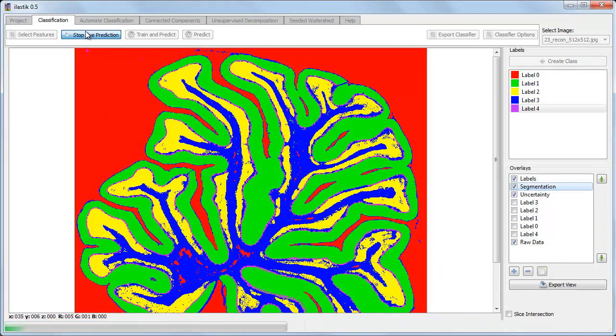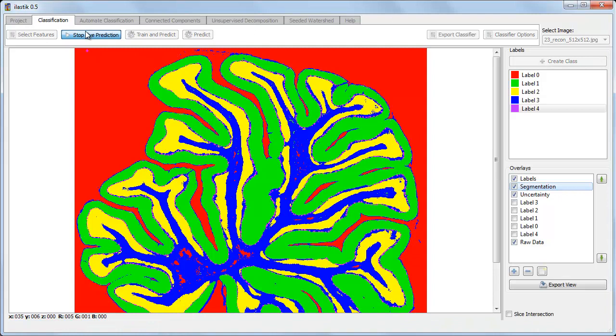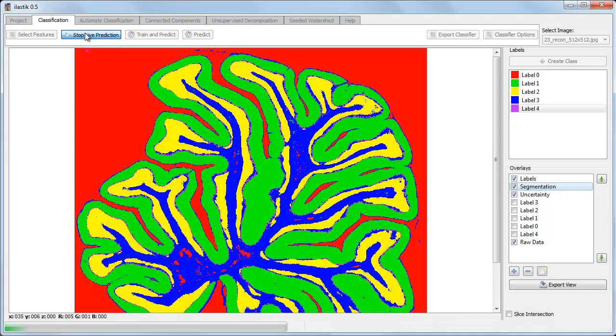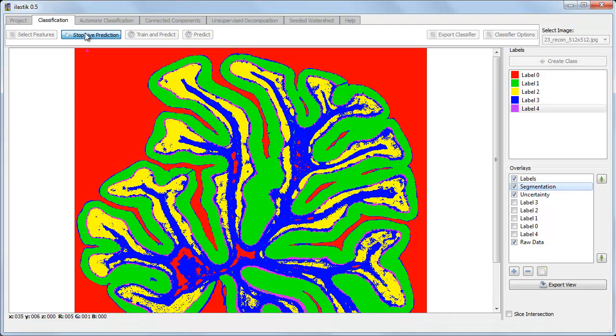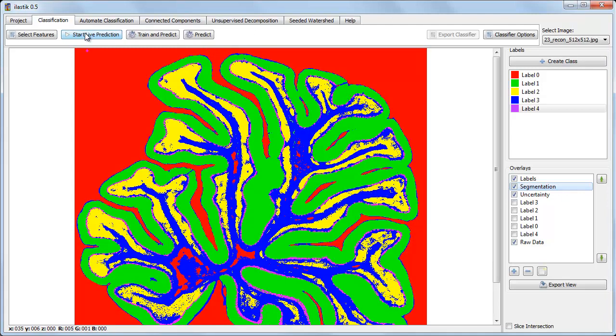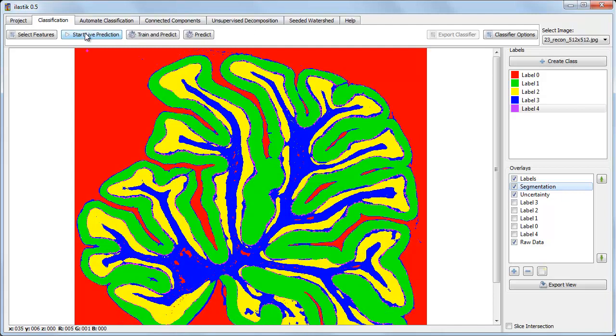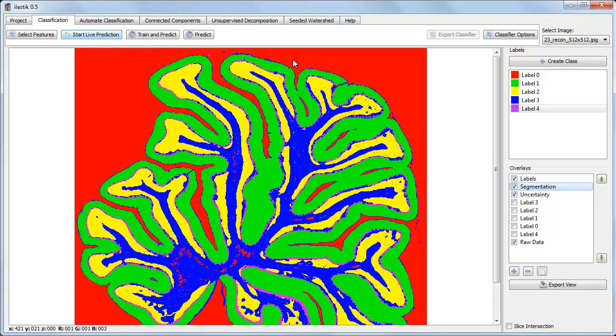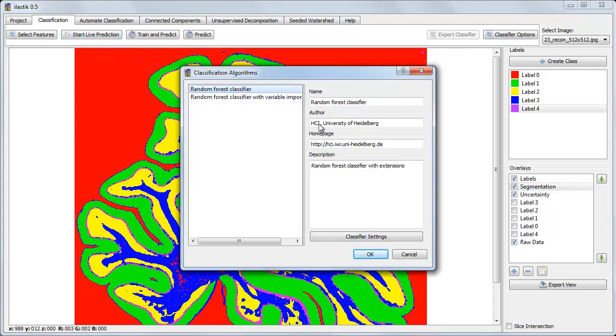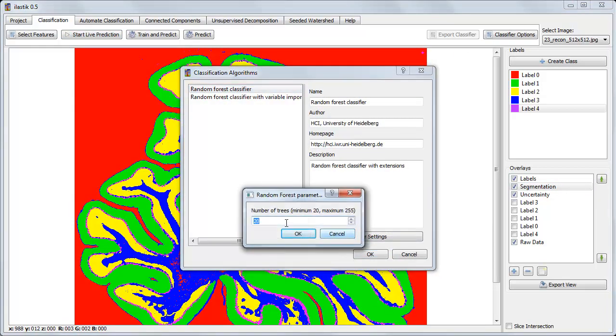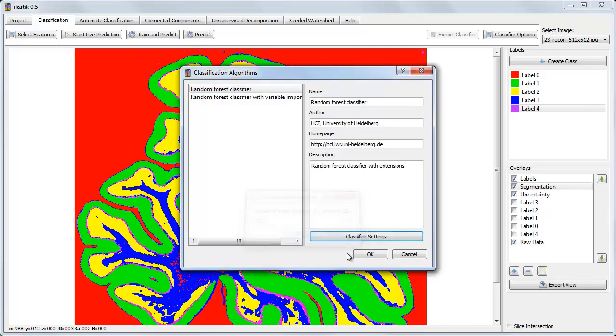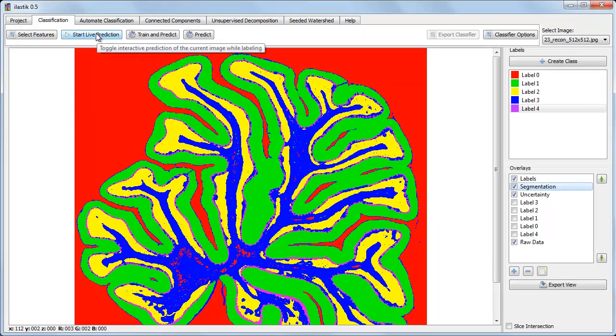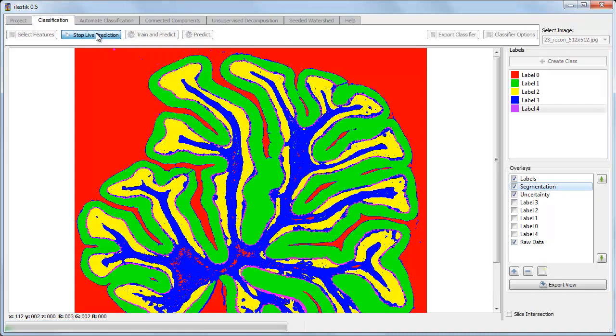So each time we hit start and stop live prediction, the classifier is retrained, and then new labels are assigned to each pixel. And notice how many of the pixels are changing each time I redo this classification. Now if instead of using the minimum number of trees I use the maximum number of trees, training and prediction will take much longer, but the results should be more consistent.